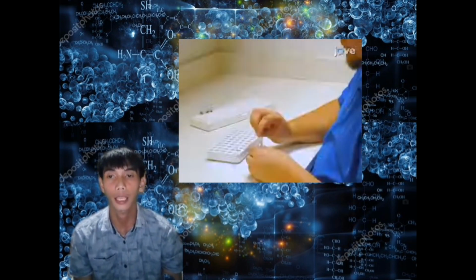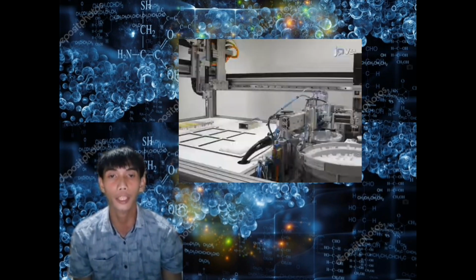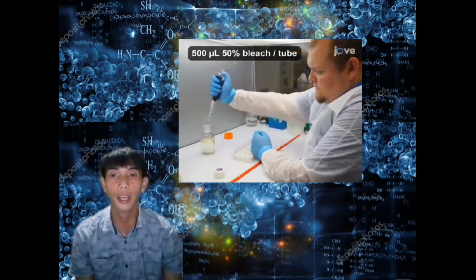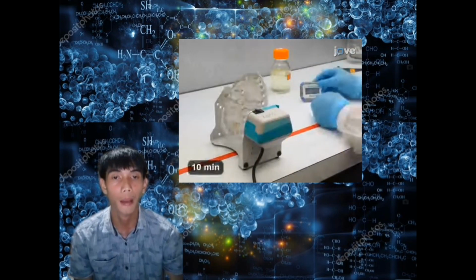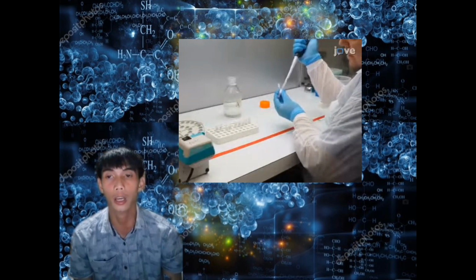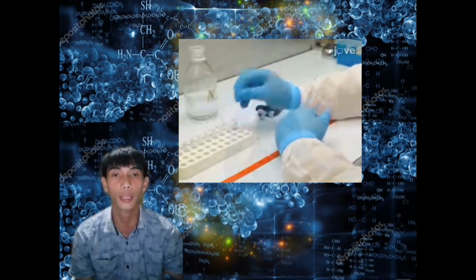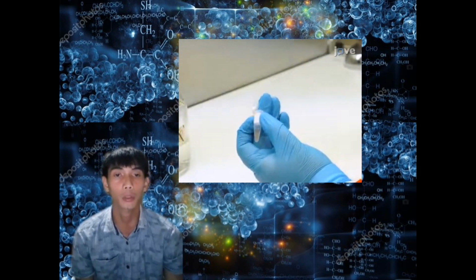sativa seeds. The seeds were sterilized, placed on Murashige and Skoog basal medium, and experimented in 2-compartment petri dishes. 3 to 4 day old seedlings were placed on MS and paper discs impregnated with SLN containing 2-nonanone or 2-tridecanone. The experiment was conducted in a refrigerated incubator with lighting and a 16 to 8 day-night photoperiod.